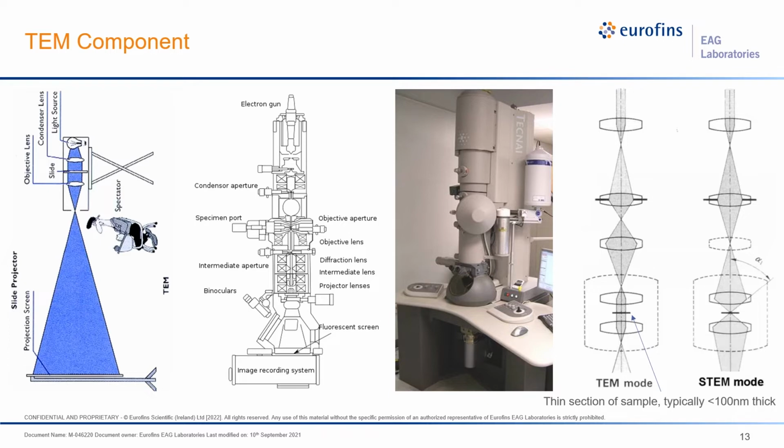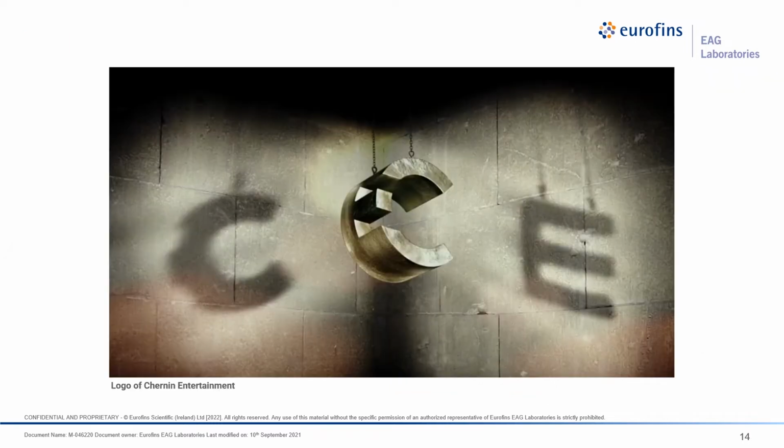I should say that for a typical TEM thin lamella, the sample thickness is typically 100 nanometers or thinner. But for some special cases, I will show you one example. For failure analysis, we actually use up to 1.5 micron, or even sometimes 2 micron thick TEM samples, to include a large portion of your sample, but it's not very common.